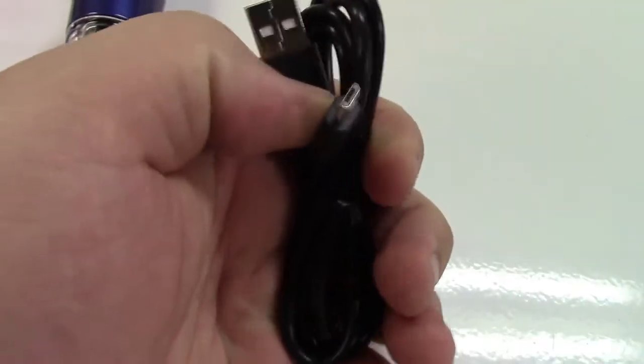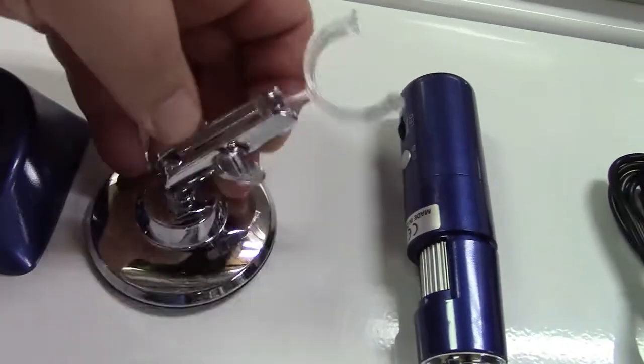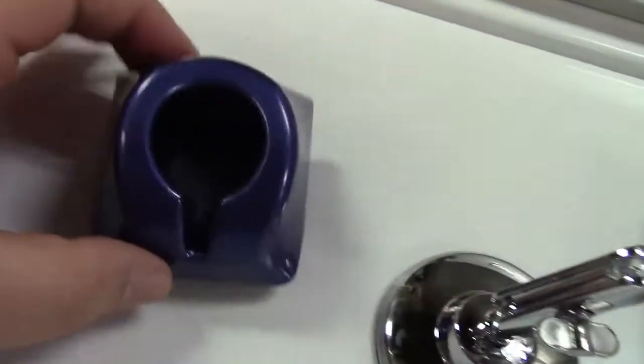I know I said this was wireless. We'll get to that in a moment. You get a stand for the microscope right here. It's adjustable. It's got like a ball mount on each end. This will tilt also. And then you just tighten a little wing nut there. And they call this part a base.